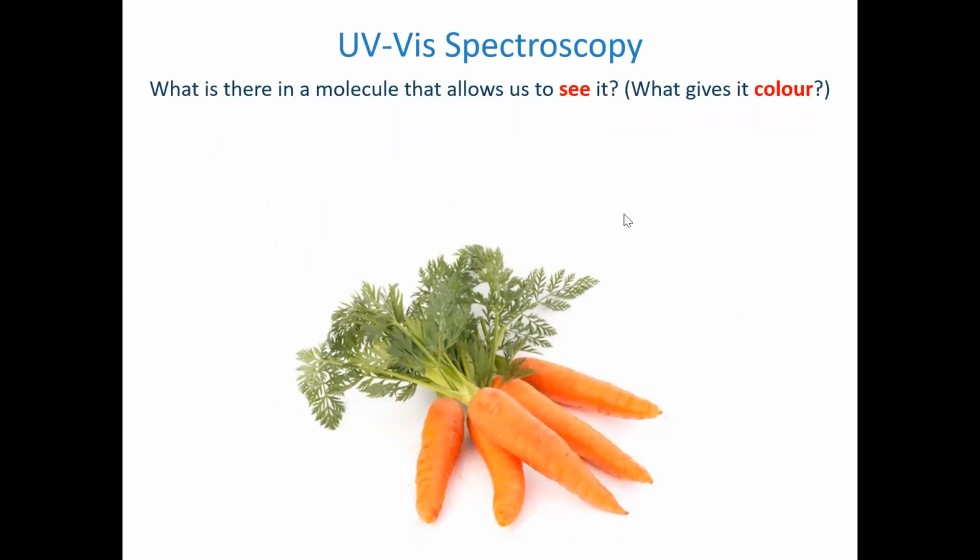Okay, so that's kind of all I wanted to say about calibration for now. What I want to do though is talk a little bit about UV visible spectroscopy. So this is a technique we're going to be using on Thursday.